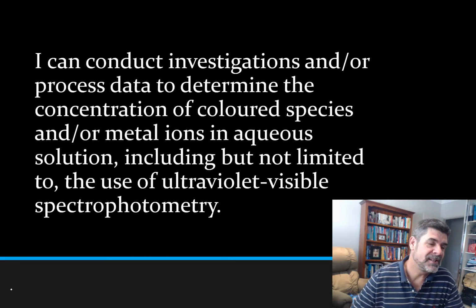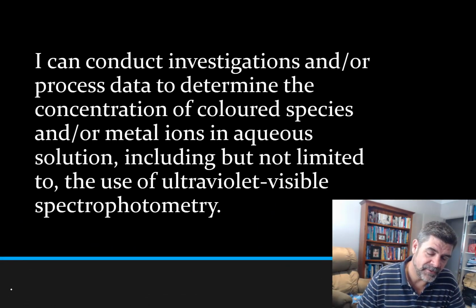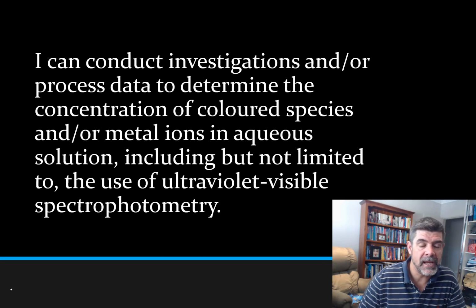This is video number 8 and we're looking here at UV-vis spectrophotometry. This is part of our analysis of inorganic ions, that is coloured species and/or metal ions in aqueous solution. However, the use of UV-vis spectrophotometry can also be applied to organic compounds.